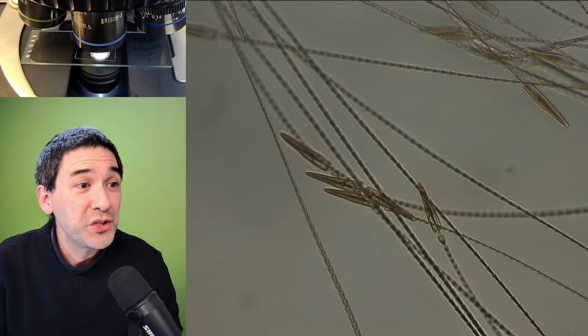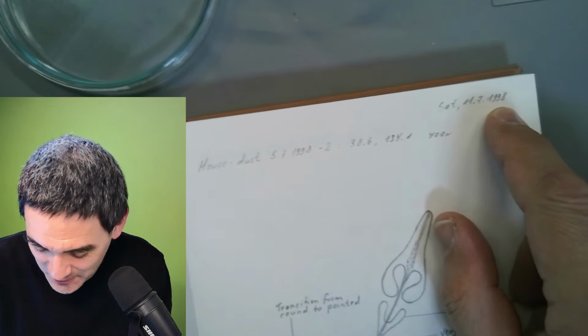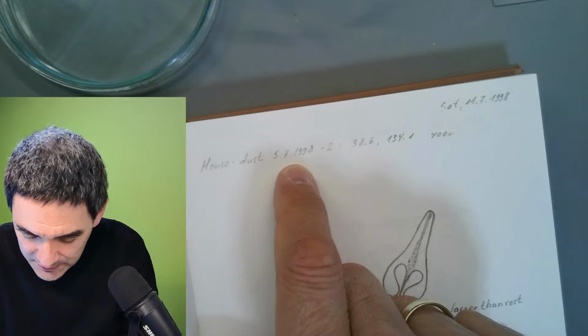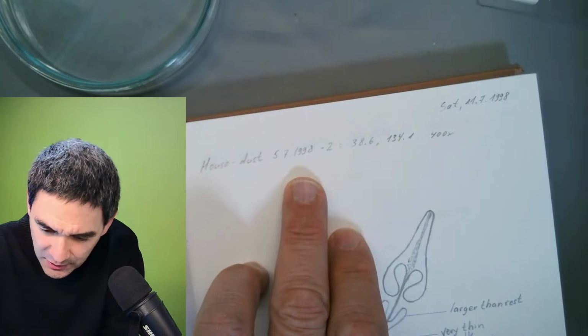This is how the book looks. I actually made pictures. When did I draw this? Look, 1998. This was quite some time ago. House dust. Oh, that's nice. 5798. 57-2. Oh, look, I've got the slide here.